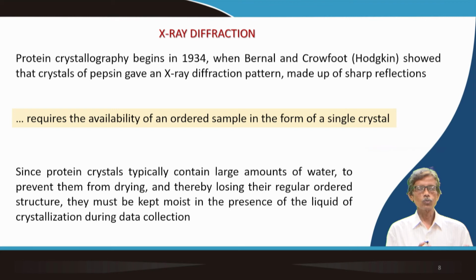When we grow small crystals of small molecules or metal ion complexes, if you take out the solvent, the crystal can break or crack. So you keep the mother liquor attached and put it in the X-ray, because when X-rays impinge on the sample there is local heating, and the local heating will evaporate the solvent trapped there.